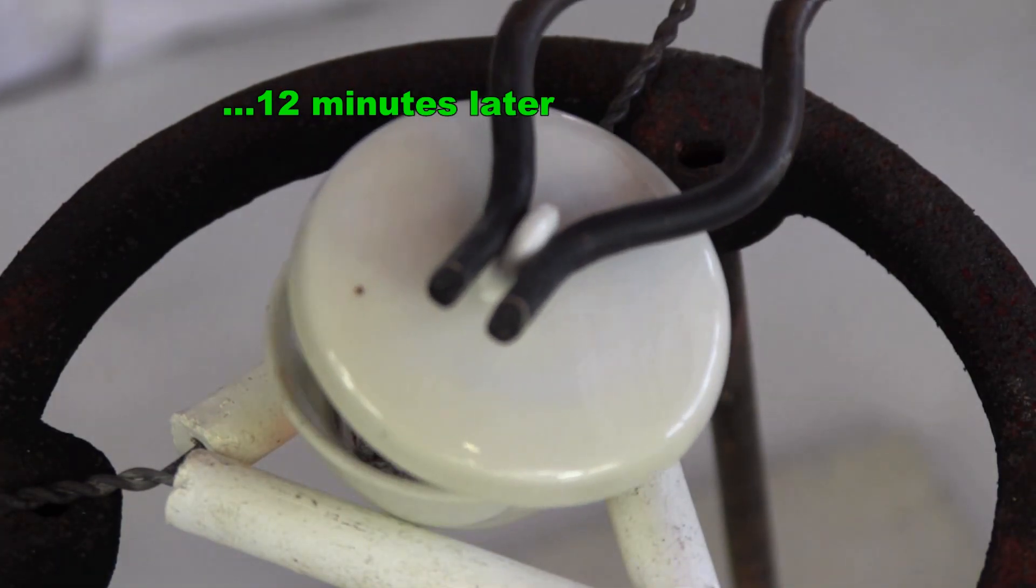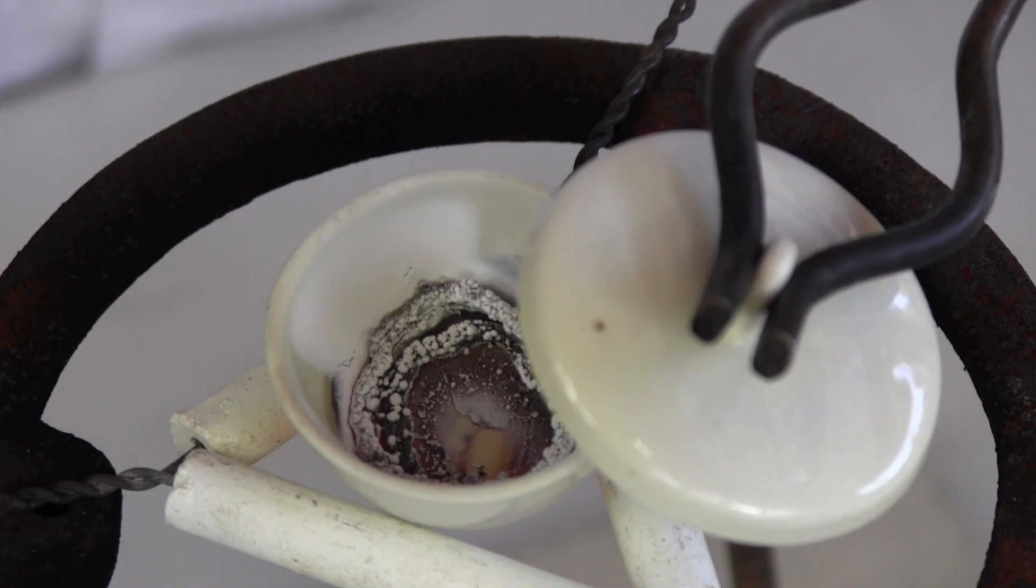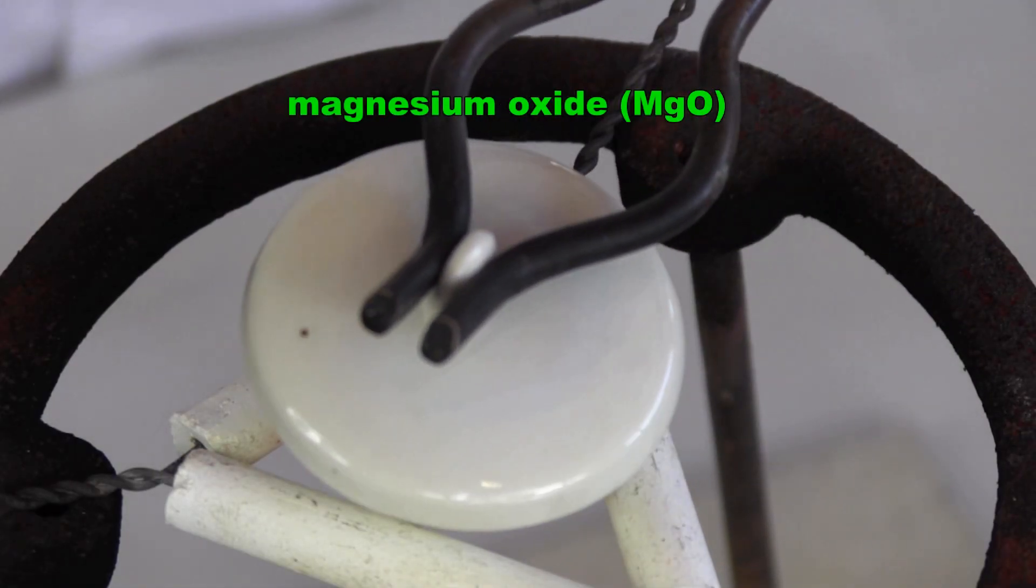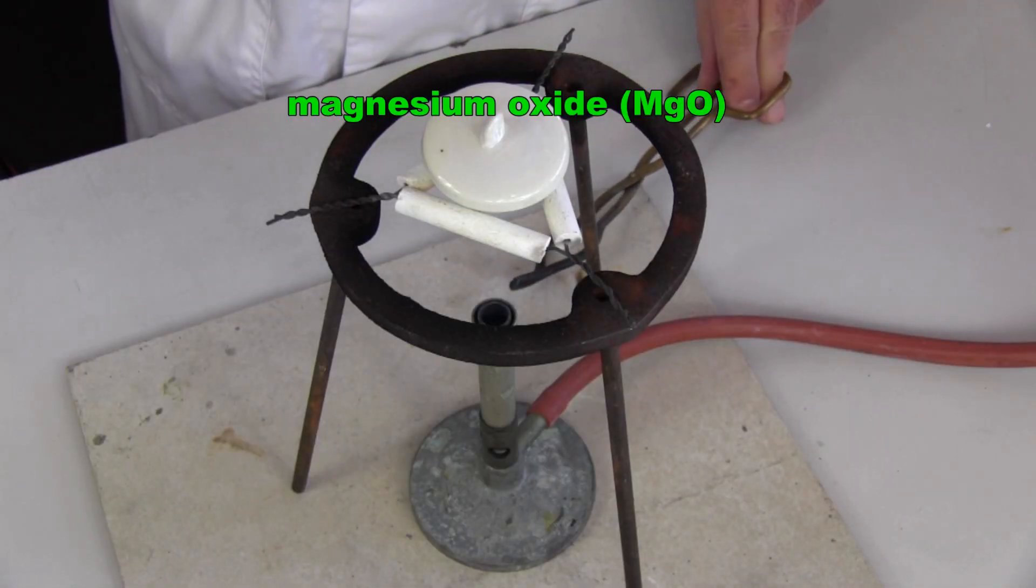The magnesium metal eventually turns into a whitish powder, which is called magnesium oxide because the magnesium atoms and oxygen atoms from the air have joined together.